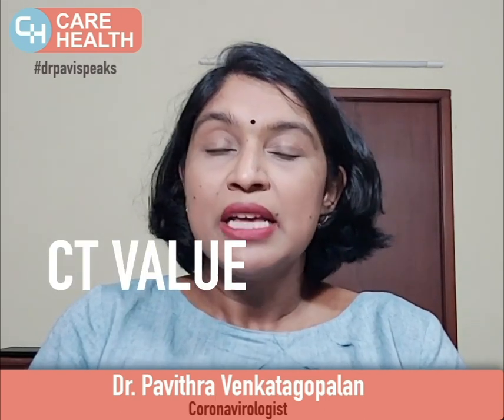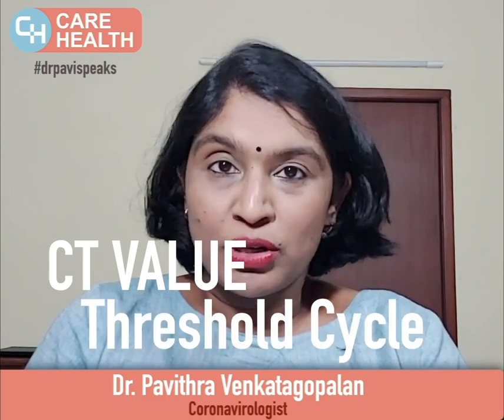In every round of amplification, the amount of DNA doubles. For example, if the sample has gone through 30 rounds of amplification, it has doubled 30 times. So that's 2 to the power 30. That's what it means. The most common term associated with RT PCR is what is called CT value. CT value stands for threshold cycle.